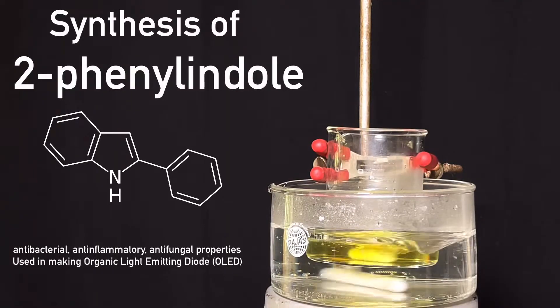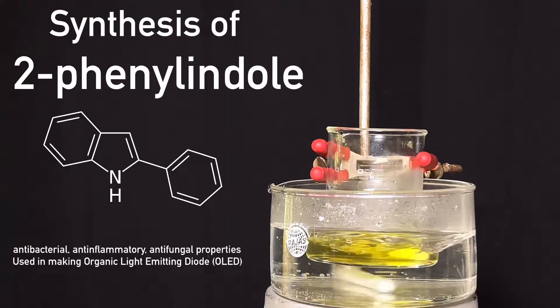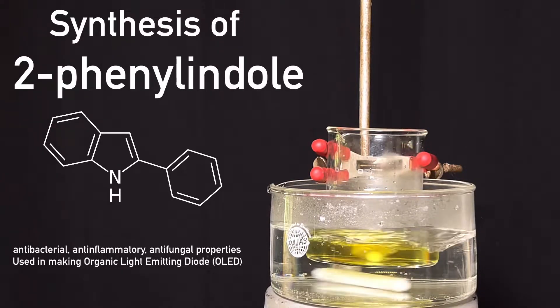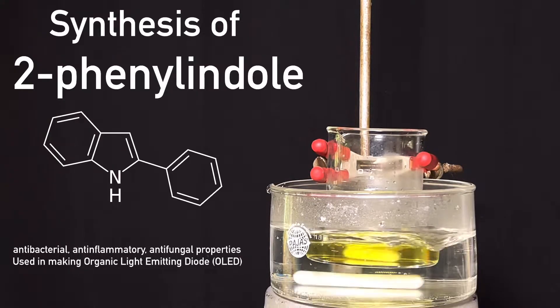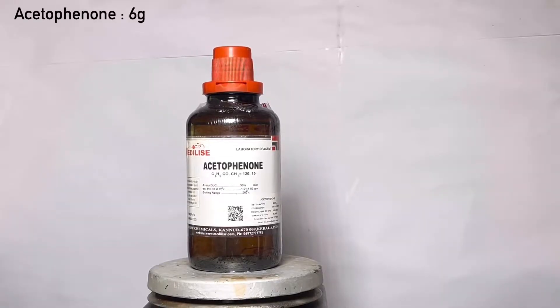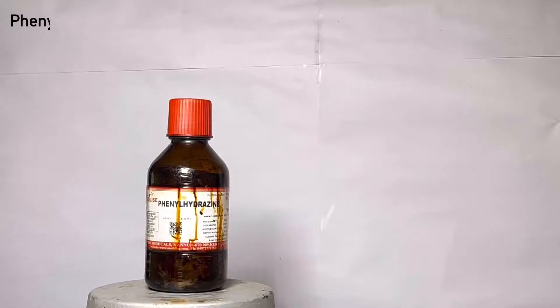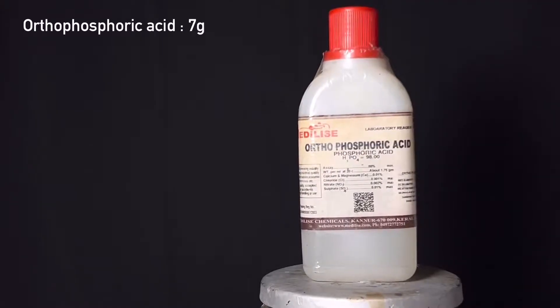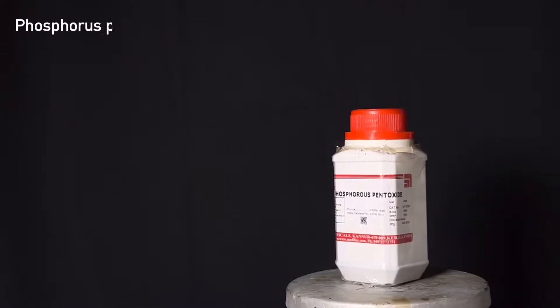Hello friends, in this video we will be synthesizing 2-phenylindole from acetophenone and phenylhydrazine using the Fischer indole reaction. For this synthesis you will need 6 grams of acetophenone, 5.4 grams of phenylhydrazine, 7 grams of orthophosphoric acid, and 13 grams of phosphorus pentoxide.